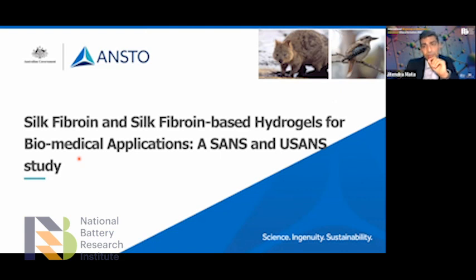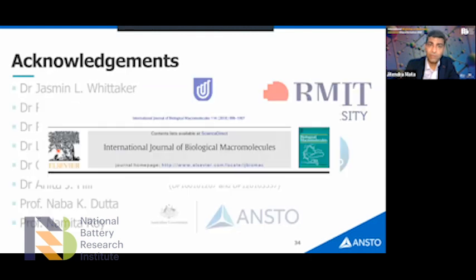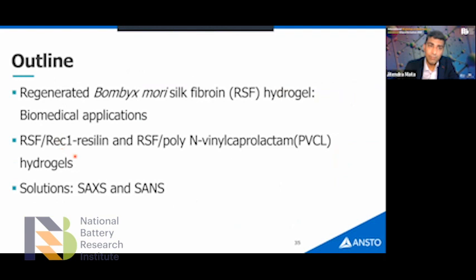Just to give you an overview, this is a collaborative work, mostly done by Naba and Namita's group, and I have been collaborating with them since 2014. We have published more than 10 papers in this area, and it is highly cited research. If you are interested, I can always send you the paper. In this work, we made the hydrogel from silk, combining silk with two other molecules: one a protein molecule and one a polymer molecule. We used not only SANS and USANS, but also small angle X-ray scattering, and I'm going to show you why we did that.